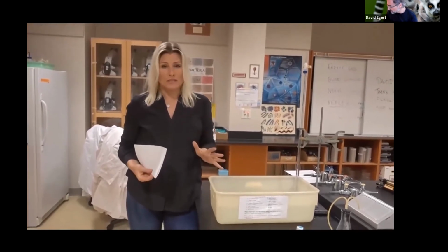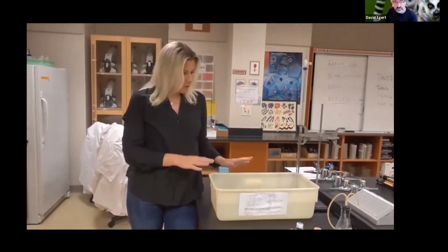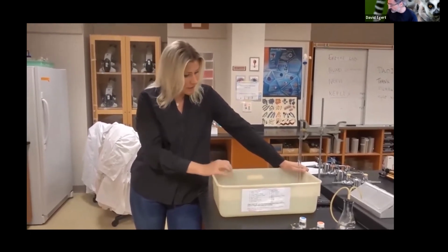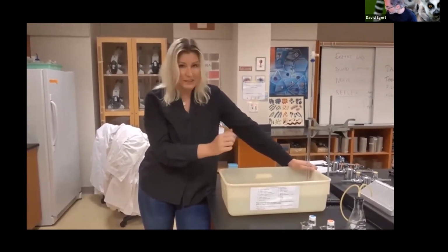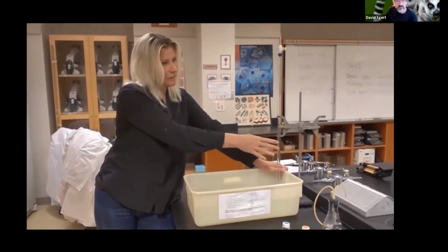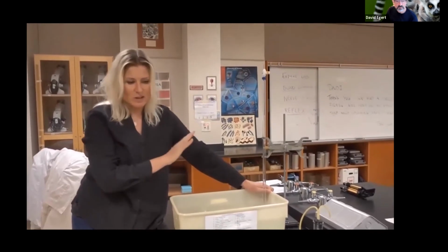But keep in mind, each trial is super fast. If you do mess up, you can just redo it again. So back to our setup. What we have here is a water bath. We filled it kind of halfway up with just plain tap water. And in this case, I have filled this one, and we're going to zero that later.